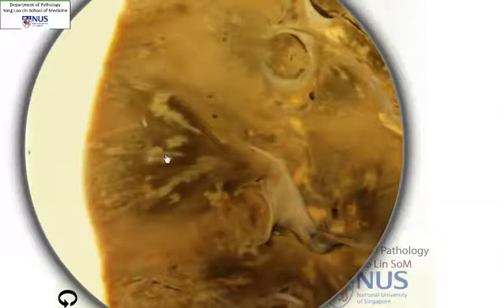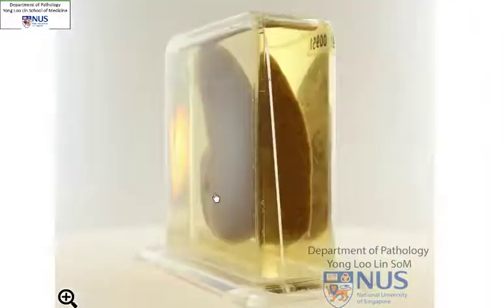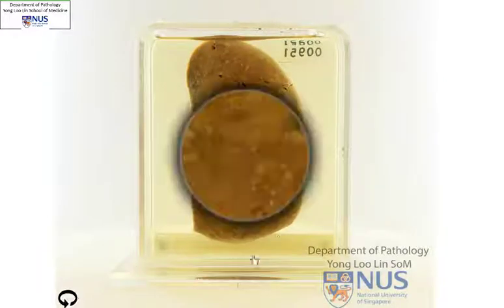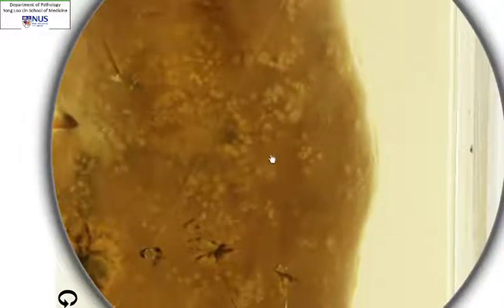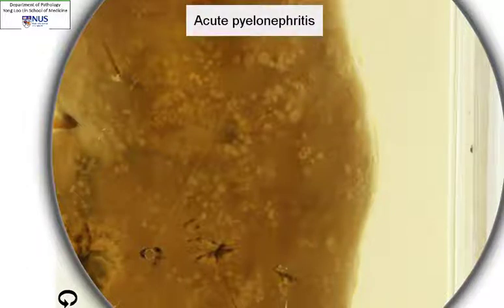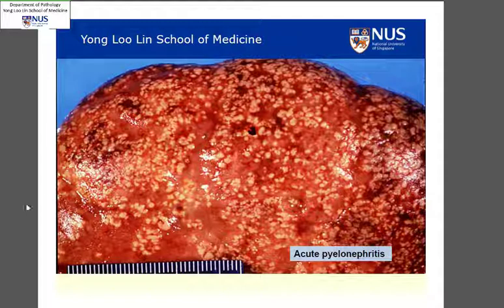Back to the gross specimen, we also saw some areas of discoloration within the interstitium that are not conforming to the tubular outlines. Looking now at the capsular surface, you can see all these pale, spotty areas. These are all micro-abscesses that are just subcapsular, just below the capsule. Most of them will be within the interstitium or in the tubules. This is a classical appearance of acute pyelonephritis. In a fresher example of the kidney, you can see all these little micro-abscesses in the subcapsular region.